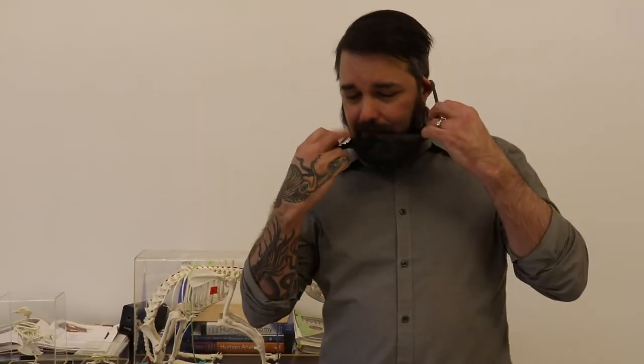Hello everyone, my name is Matt McDonald. I'm the Lab Director here at the Department of Biology at Drexel. I'd like to welcome you here and thank you for considering pursuing your education here with us.